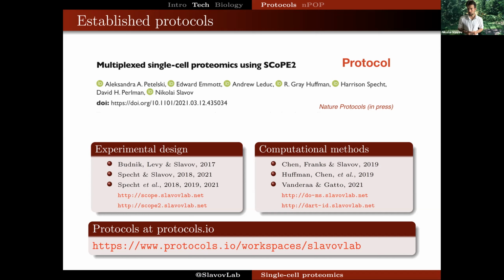And these technologies, while being far less popular and widely applied than single cell RNA sequencing, are actually fairly mature. We have published multiple protocols that are available either via preprints or peer-reviewed articles, and there are websites that you can use to access resources so that you can start implementing those methods yourself. And we also take advantage of protocols.io to deposit all of our new protocols there, so you can access our protocols from this link here.